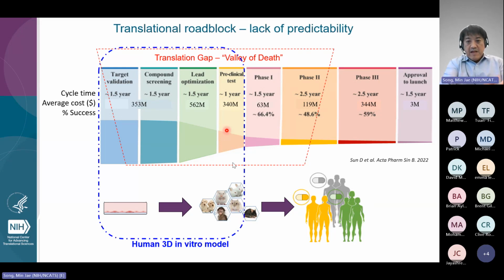Recently, several innovative in vitro models were developed and demonstrated better physiological relevance, and these models have been already extensively used in the basic science field. Accordingly, NCATS established the 3D tissue bioprinting lab to implement the 3D models into the translational sciences to improve the predictivity of the assay platforms for drug screening, for drug discovery.